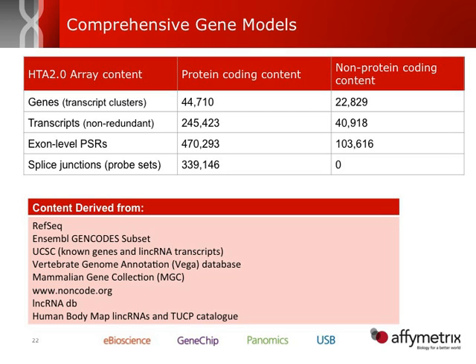So the protein coding content are the things that are interrogating the protein coding regions, the genic regions. Everybody asks me, well, we say we interrogate 44,700 genes. These are really what we call transcript clusters. We know that there are about 25,000 or 26,000 genes in the human transcriptome, but some of these things are made up of ESTs, and there could be different isoforms being expressed, and we encapsulate all those into this gene category. So that's why we come up with this number, 44,700 genes or transcript clusters that we're interrogating.